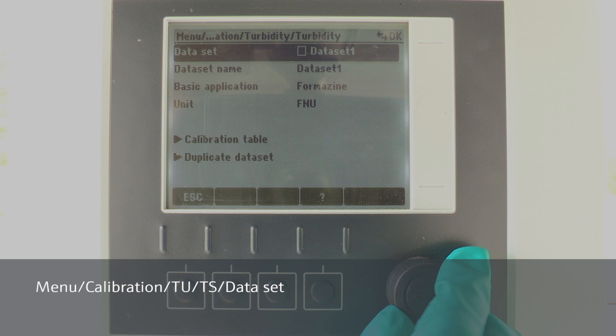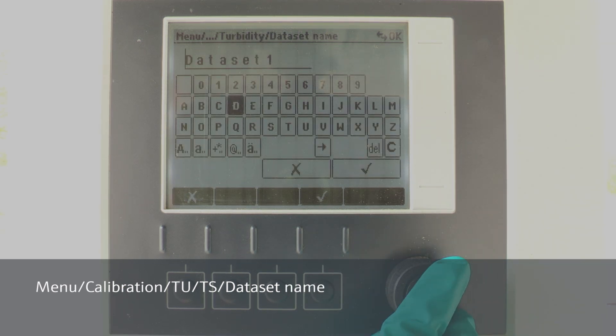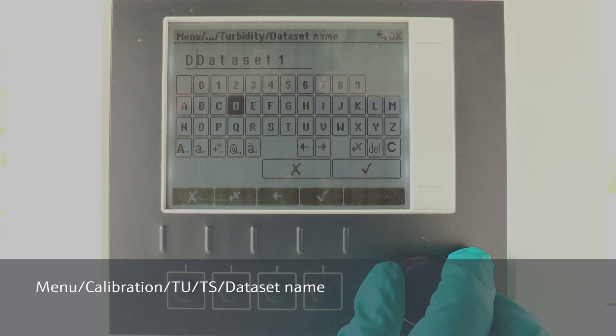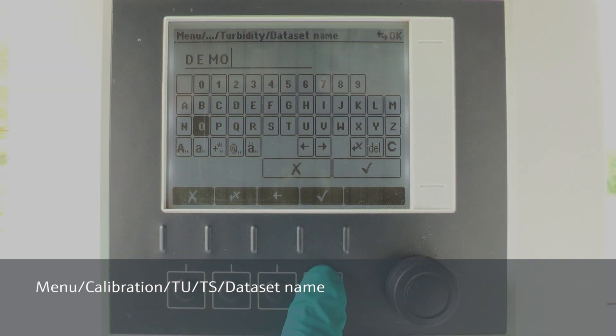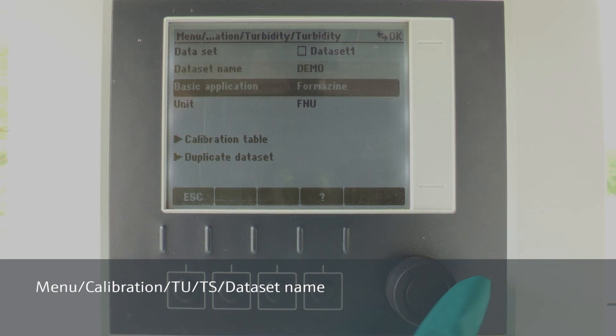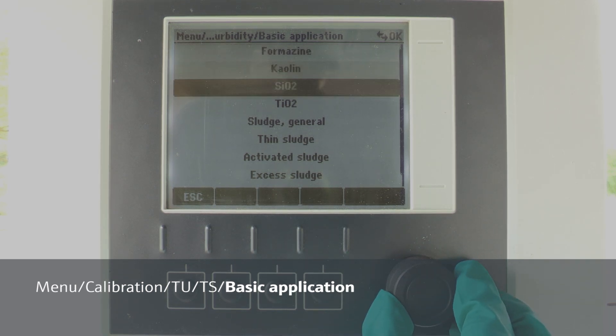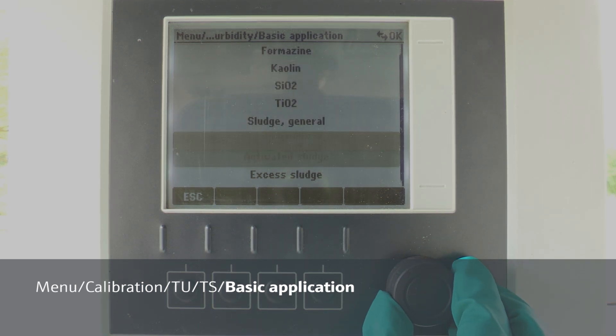Now we specify a name and select a suitable application model according to your process. If you are not sure about the correct application model, please refer to our operating instructions, chapter application. In our case, we take the excess sludge model.